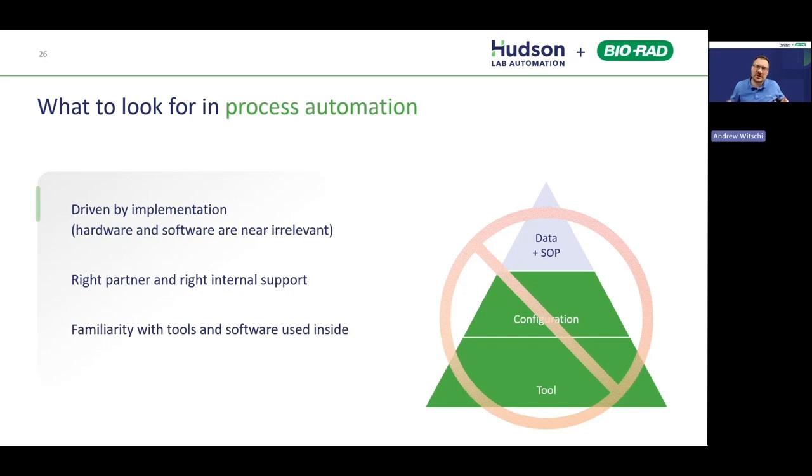You're linking together all these modules and steps, and you need to tell people when they need to interact with the plates, when they need to load consumables, when they need to do error resolution. All of those concerns start to become not really focused on the science, but focused on what's happening in your lab, and those are decision trees that are not associated with the core assay.